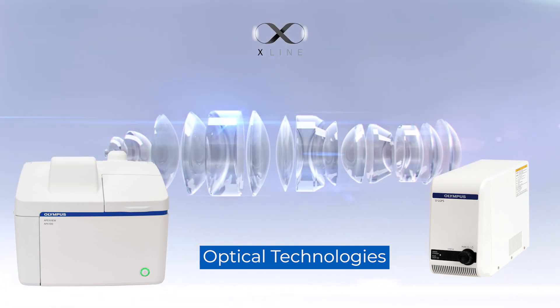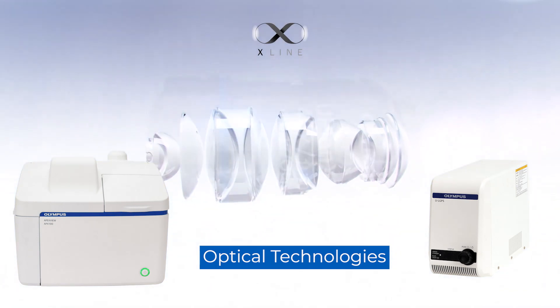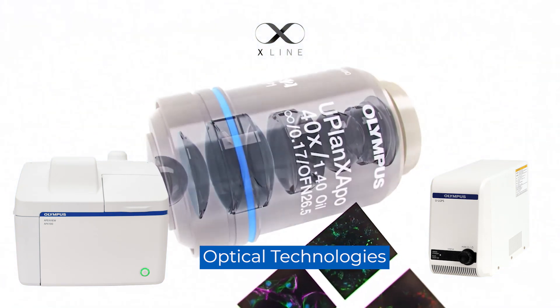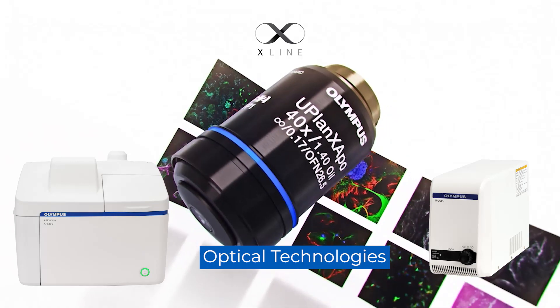The APX100 microscope uses our renowned optical technology, including high-performance X-line objectives, so you can be confident in the quality of your images.